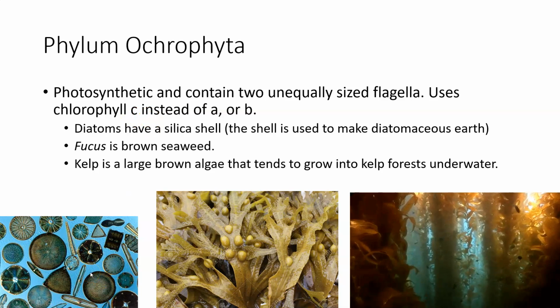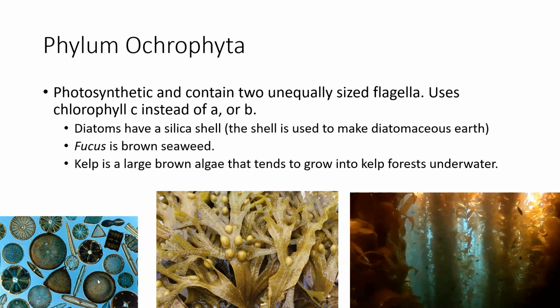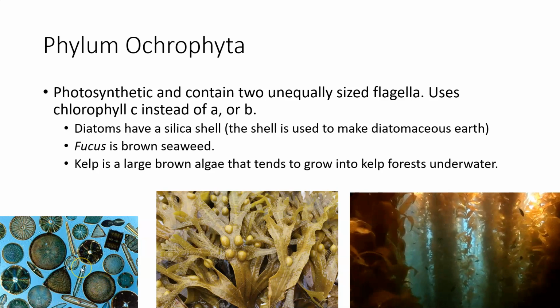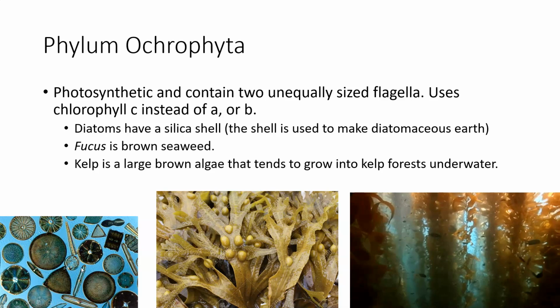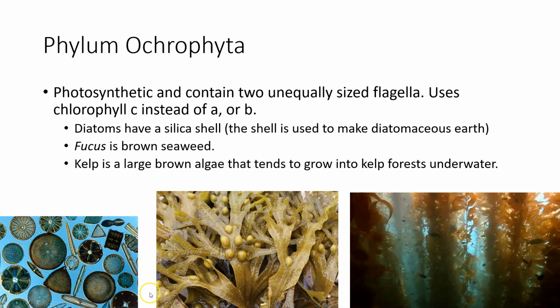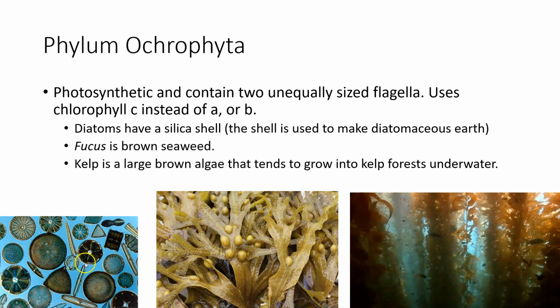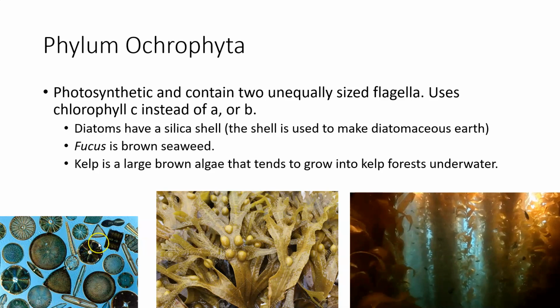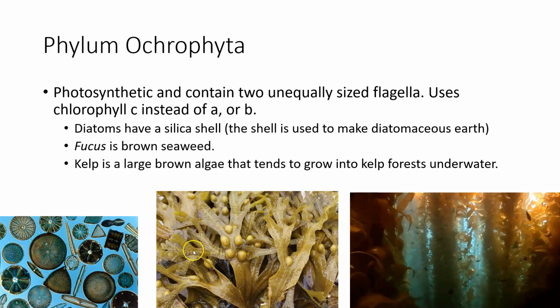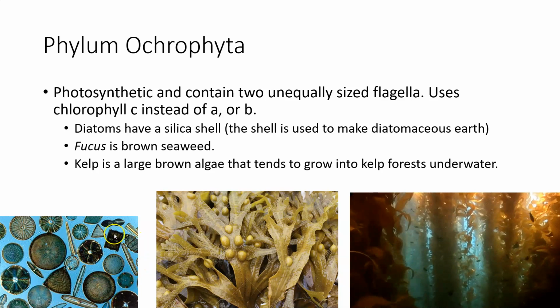Diatoms you could only see if you have a microscope because they're single-celled. If you have OCD, diatoms should make you really happy. They've always made me happy, and I do have OCD. They're so beautiful to look at under the microscope. They come in every shape, and because they have a glass shell, they're prismatic and they reflect light, and it's just beautiful to look at them under the microscope. If you have ever used diatomaceous earth as an insecticide or as a pool filter or anything like that, you're using the dead skeletons of diatoms.